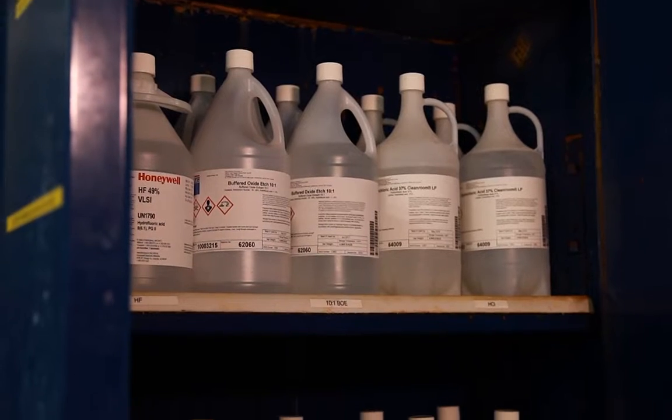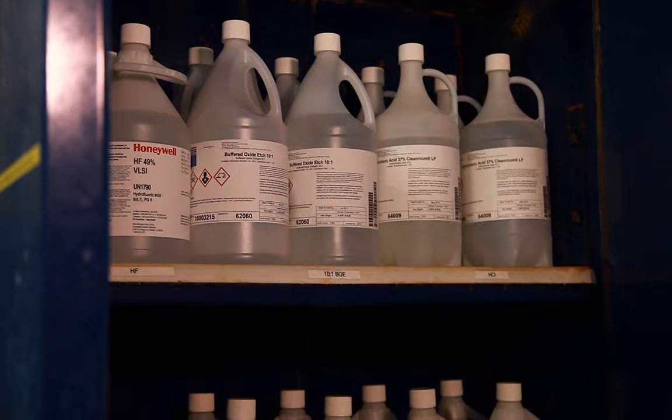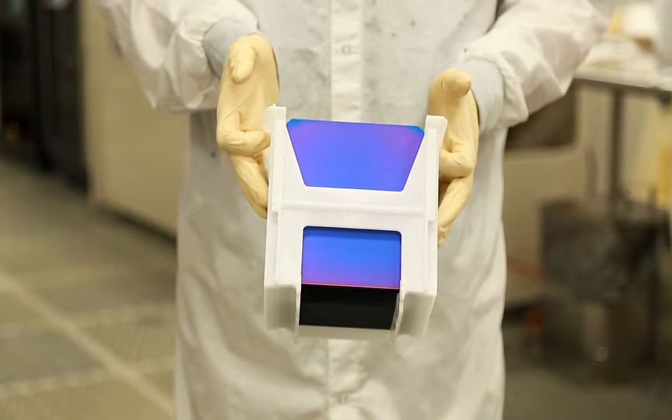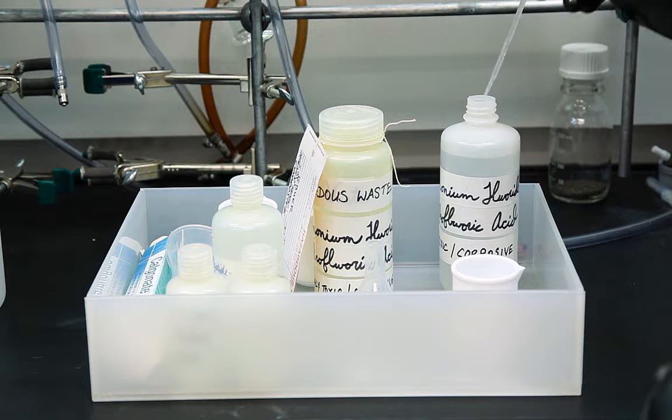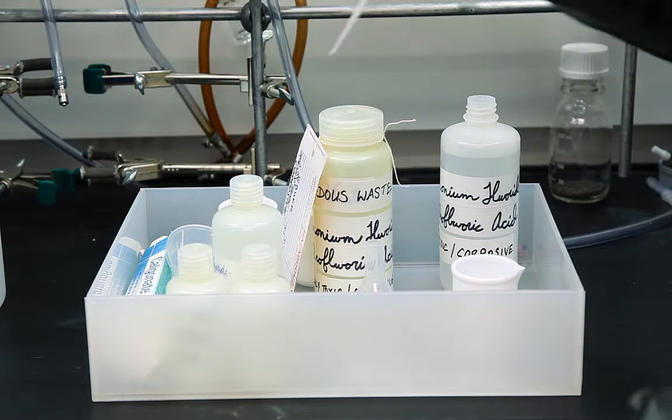Among acids commonly used in laboratories, HF is a particularly hazardous and toxic substance and is unique in its means of attack on human tissue and other materials. While this makes HF an effective tool, it also means we must prepare accordingly to prevent exposure.